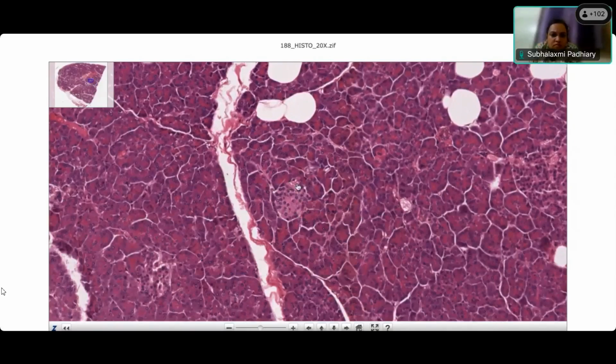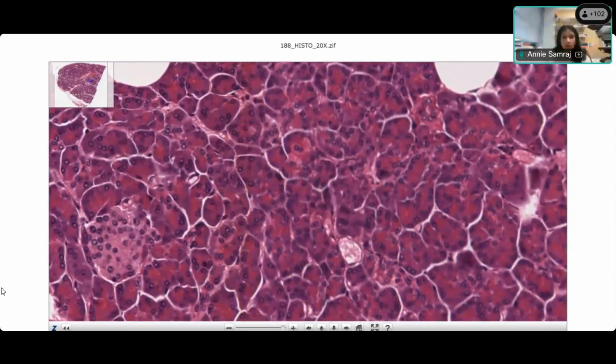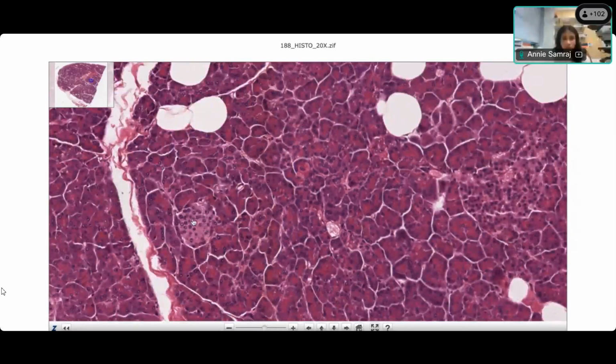And so we talked about the two types or the distribution of the islets. So when it's oval like this, or a round, cohesive structure, what do we call that distribution? Compact. Yes, cluster or compact. Yes, this is the cluster distribution, the compact distribution.